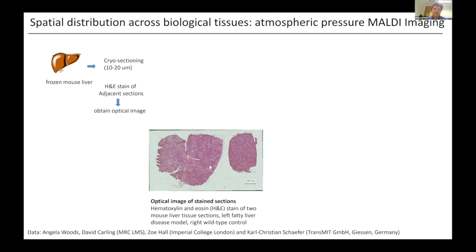And then the sections that we stained here, that is essentially an adjacent section to the one we will use for the MALDI imaging experiment. We then coat the thin section with a MALDI matrix, and a MALDI sprayer is normally used, where you have a solution of the MALDI matrix being sprayed onto the tissue. And then that whole prepared tissue is set up on an acquisition stage.